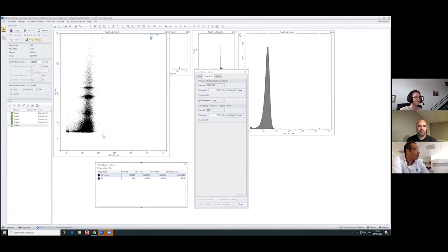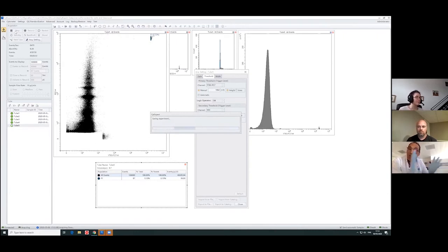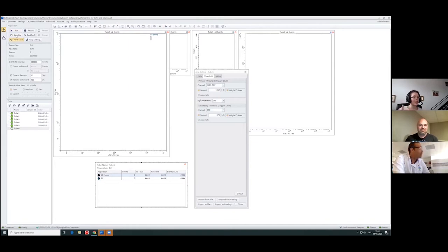If I want to see more populations, I can go and increase my gains. But now I'm recording, so I cannot do it. I will stop it, and I will play with the gain. This is another advantage of this instrument. It's not like the previous Aurora, where you have a voltage set and there's nothing you can do. In this case, you can fine tune a little bit more by increasing your gain. So you should keep everything run at relatively the same gain for the sample set, once you have your control set. Once it's set up, you should run all in that set.